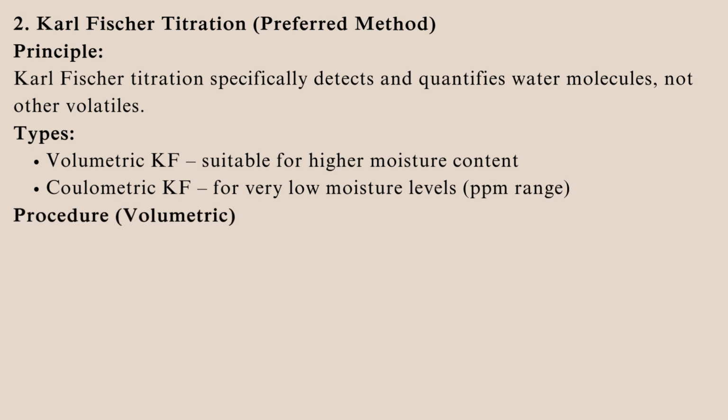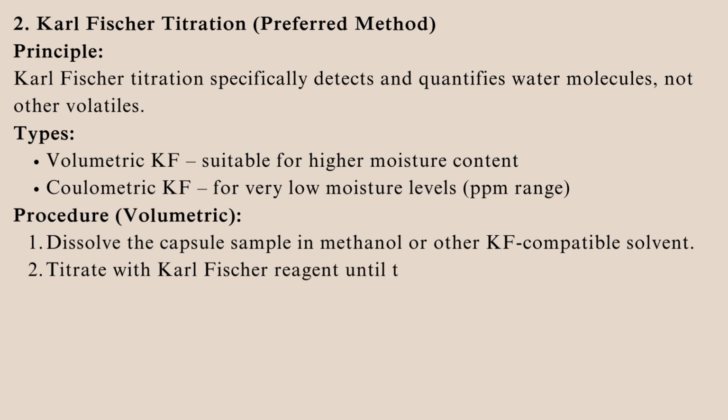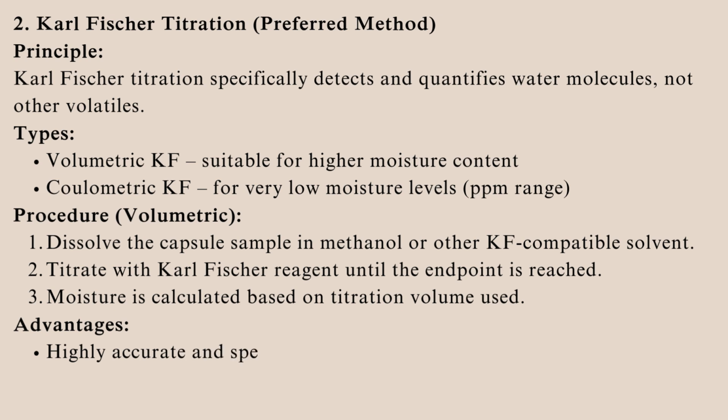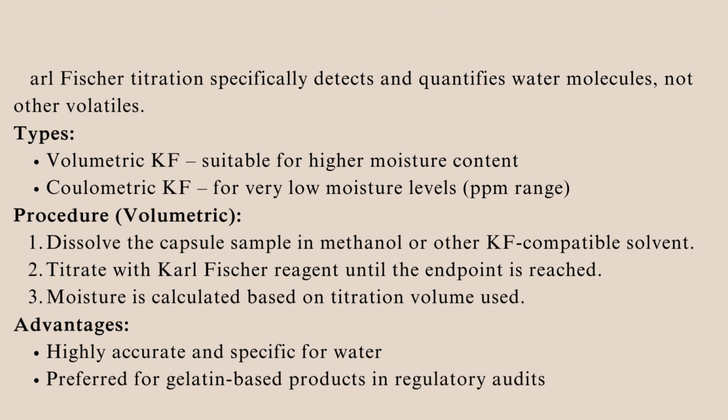Procedure: volumetric, dissolve the capsule sample in methanol or other KF-compatible solvent. Titrate with Karl Fischer reagent until the endpoint is reached. Moisture is calculated based on titration volume used. Advantages: highly accurate and specific for water, preferred for gelatin-based products in regulatory audits.